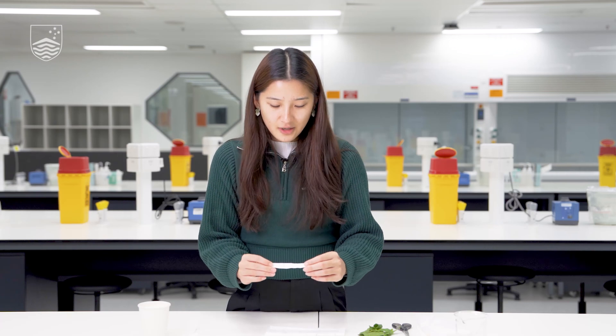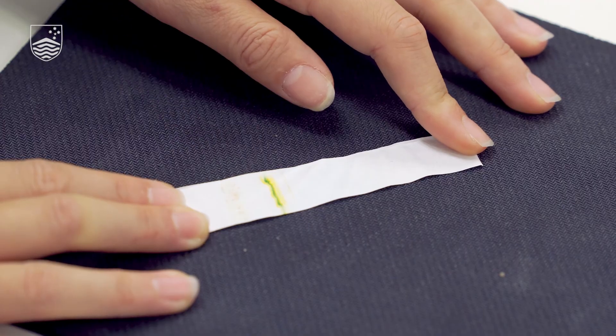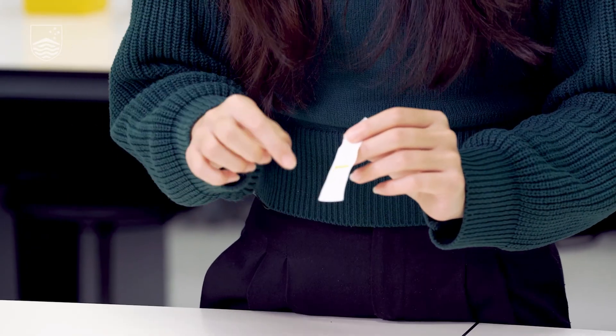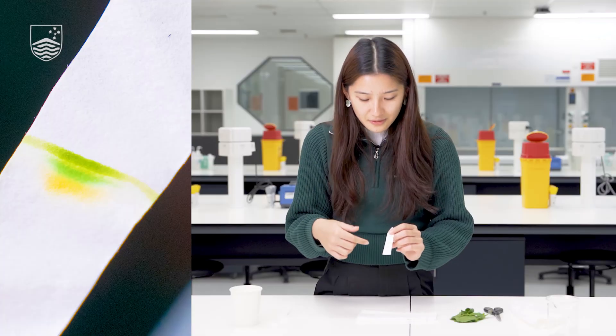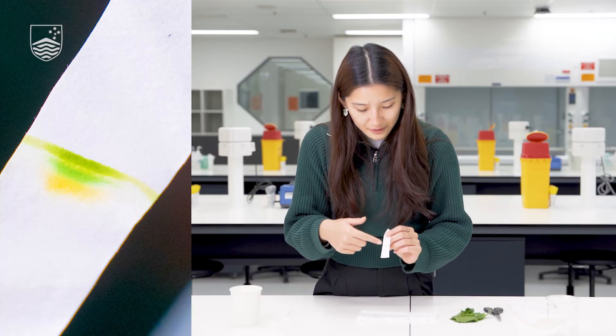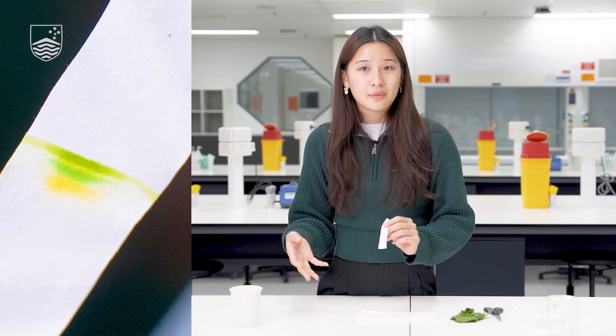So what did you find? Here's a filter paper prepared earlier and hopefully your sample looks something like this. Even though our spinach leaf appears very green to our eyes, the filter paper has managed to separate a variety of different colours. We have a strong green band, a yellow band, and very faintly at the top a slightly orange-tinged band. So what's causing all of these colours, and why don't we see them when just looking at the leaf?